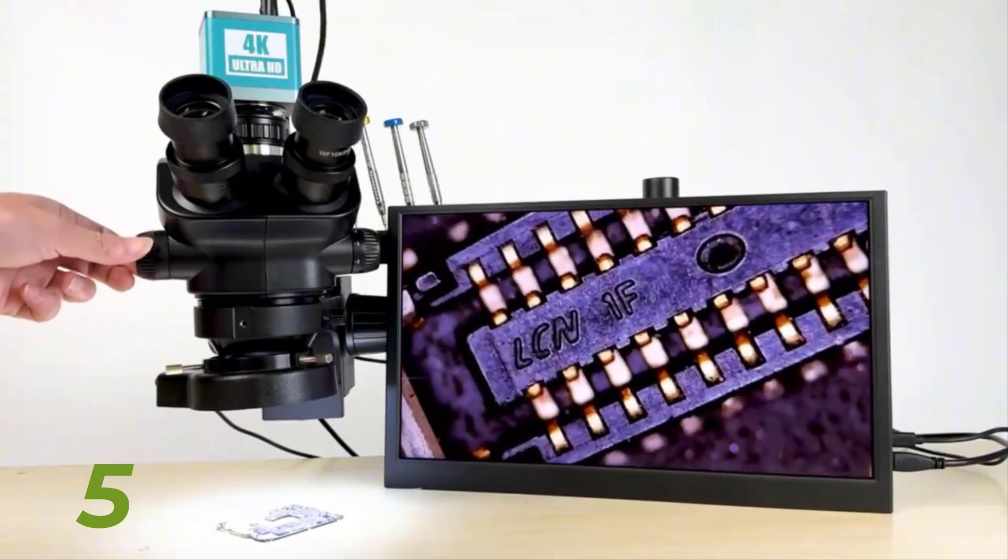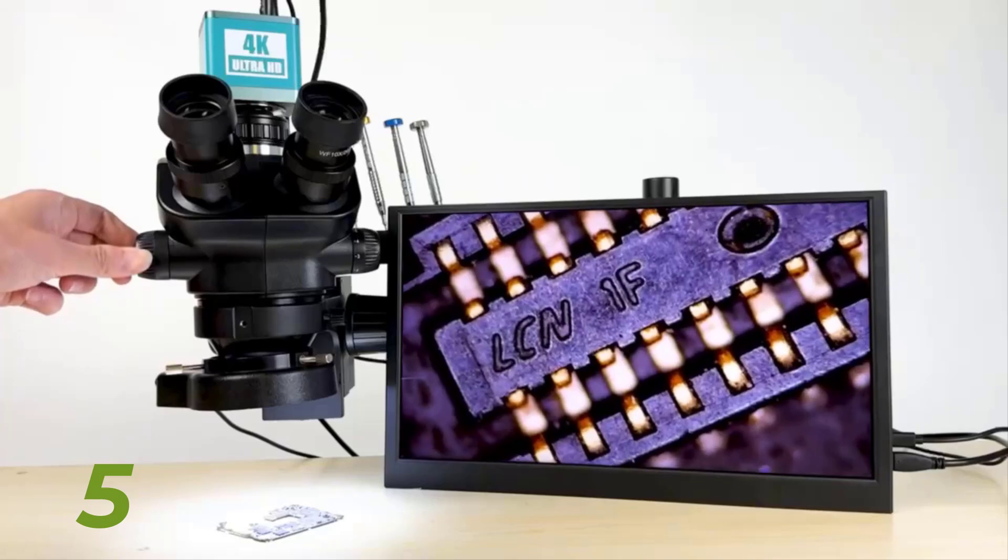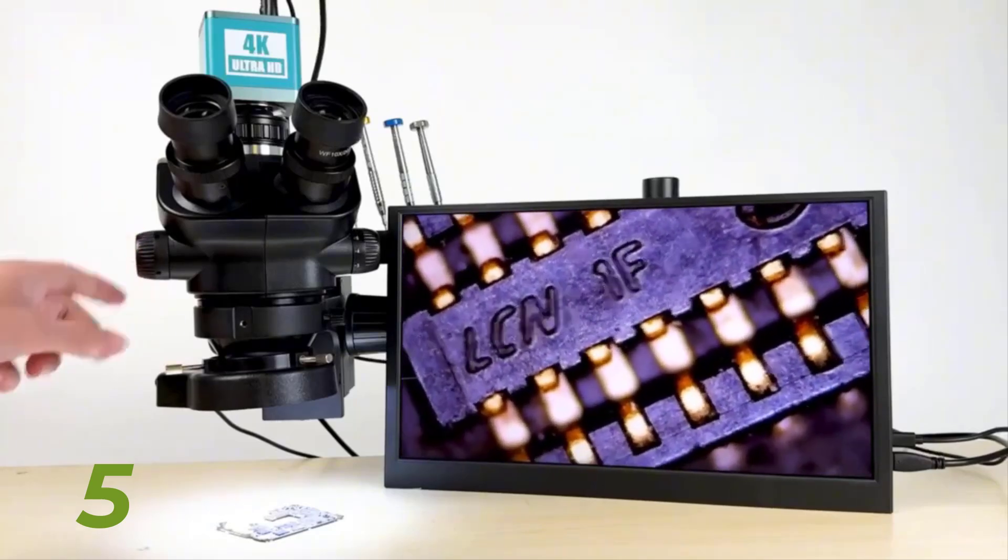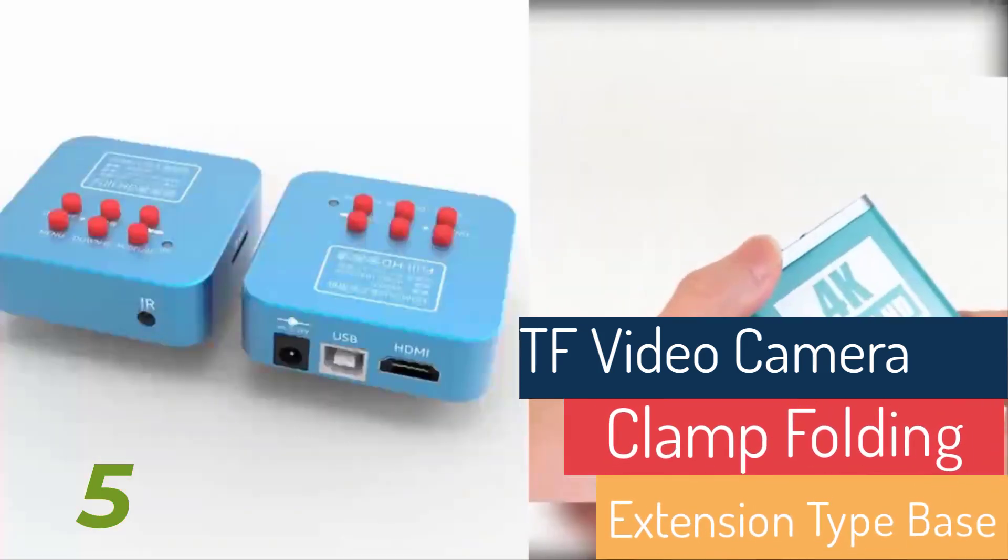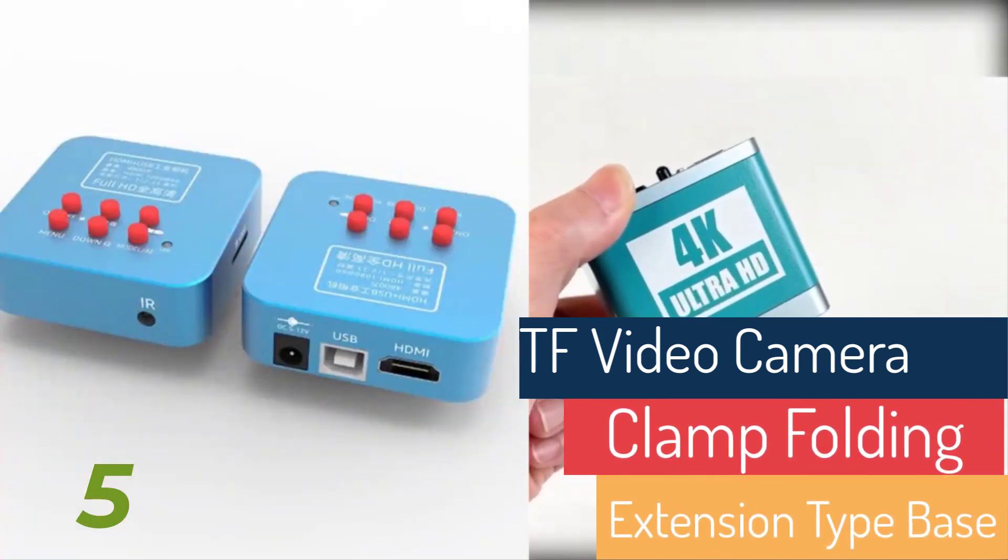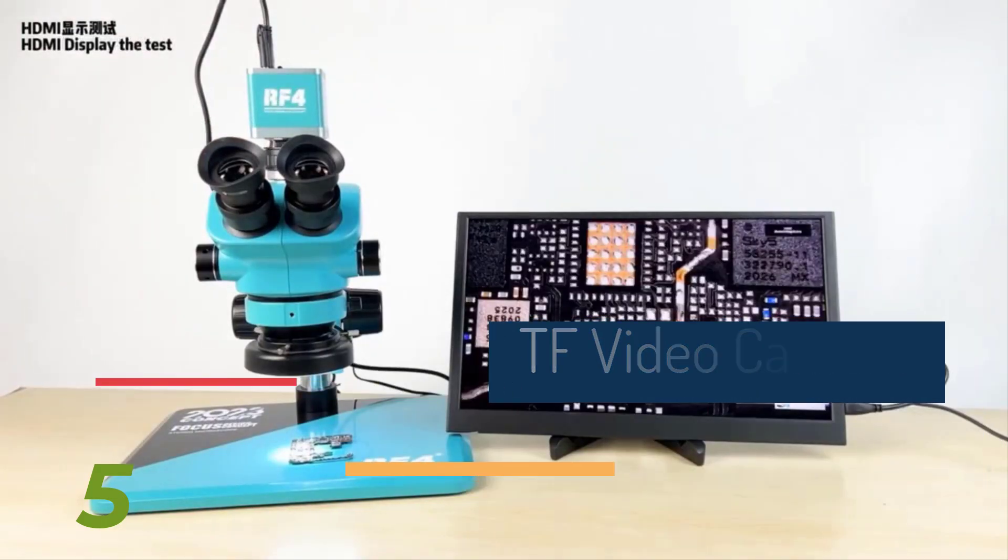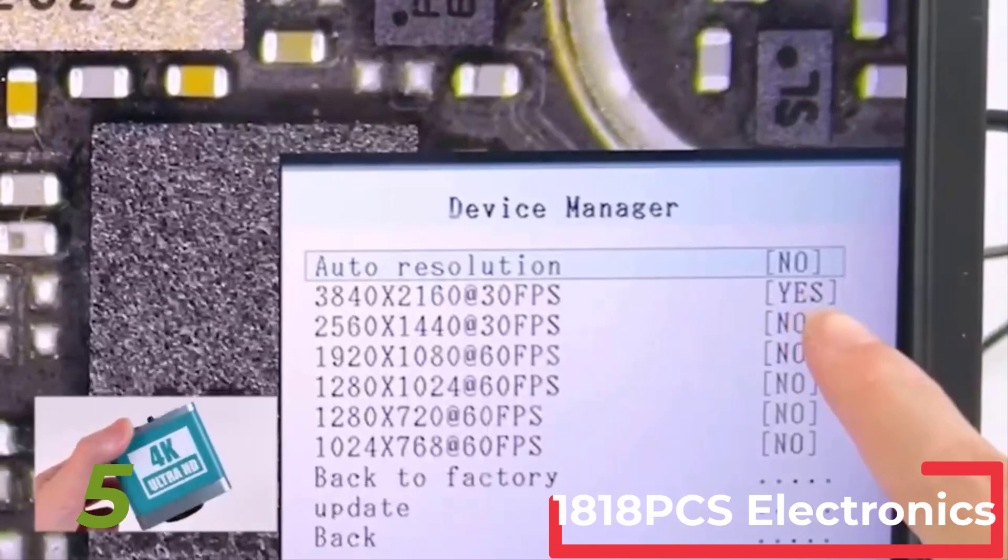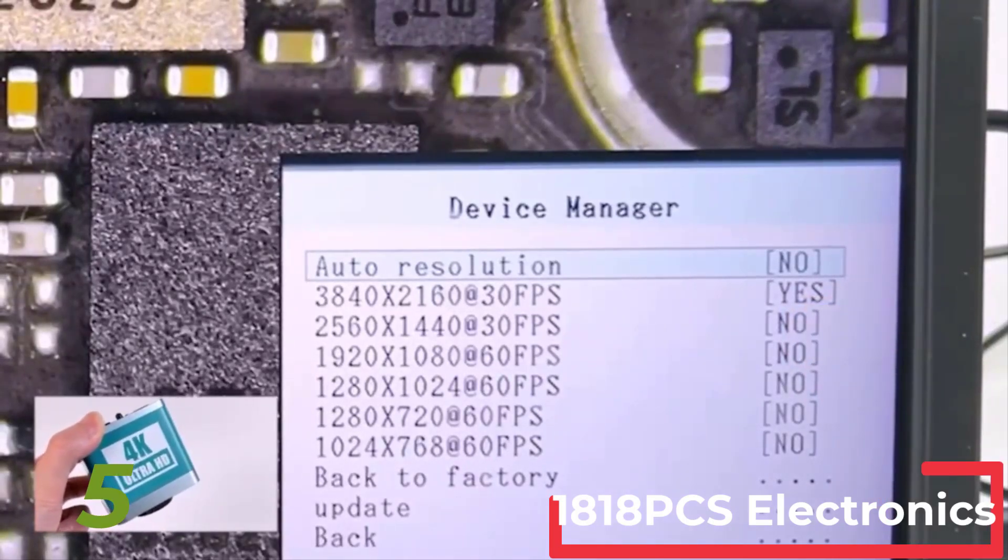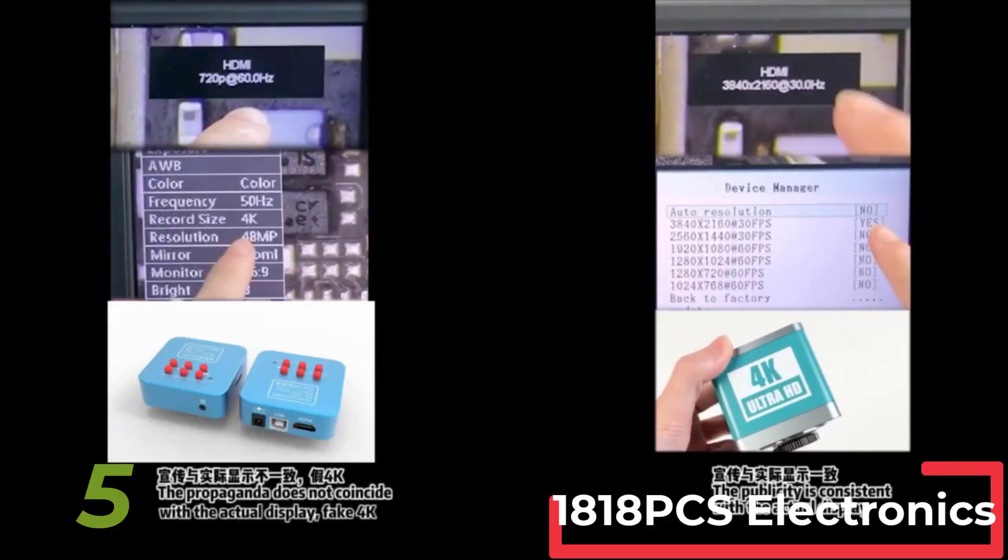This versatile microscope set is ideal for a wide range of applications: biological sciences including zoology, botany, entomology, histology, mineralogy, archaeology, geology, and dermatology; textile industry for inspection of raw materials and fabric quality; electronics industry for soldering, mobile phone repair, watch maintenance, and inspection of electronic components; and accessory inspection including jewelry and diamonds.